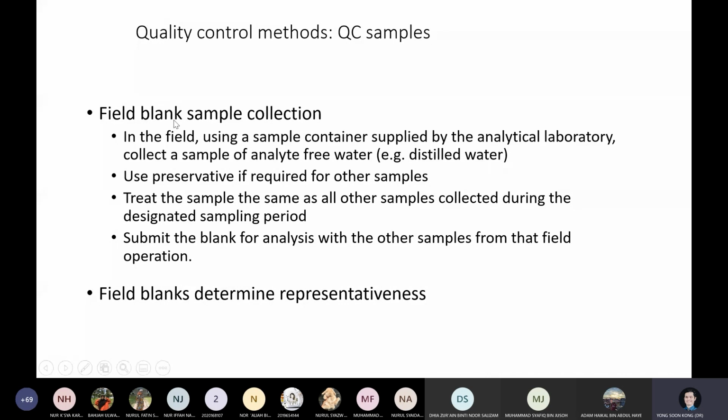So in the field, why do you want to do it? Because when you put in distilled water, by the time you carry it back into the lab, what do you expect? You expect distilled water inside there with no increase of contamination. So what is the purpose of doing this? This is to mimic whatever you do in the field, but only using distilled water, something in which you should not detect anything.